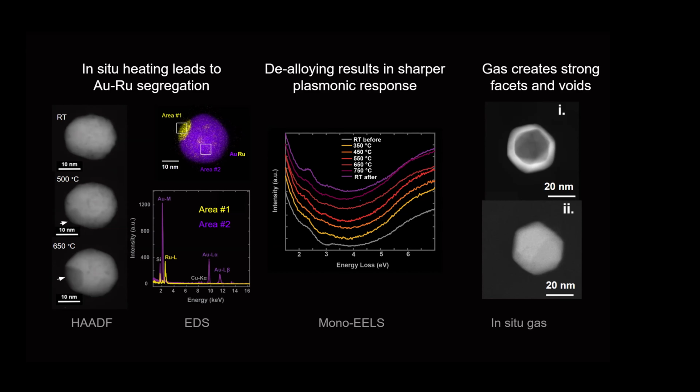That's definitely a complex question. My understanding is that hydrogen can reduce species. So when these are colloidally synthesized nanoparticles, and you have hydrogen, which is one of the precursors for ammonia, so these are all done in a mixture of hydrogen and nitrogen gas, you can get reduction of species. And so at higher temperatures, I think that allows for different rates of diffusion, and thus some of these materials can be carried away by the gas preferentially. So I think it's likely that ruthenium is being carried away through this gas flow at high temperatures, like 750 degrees C.